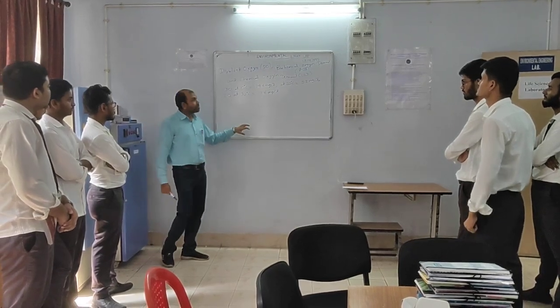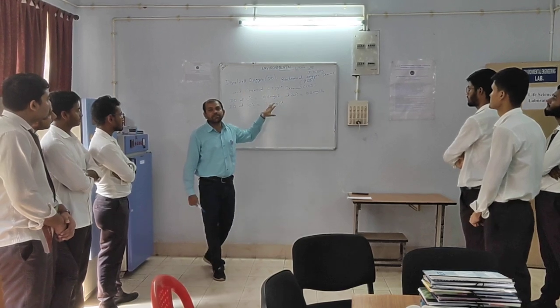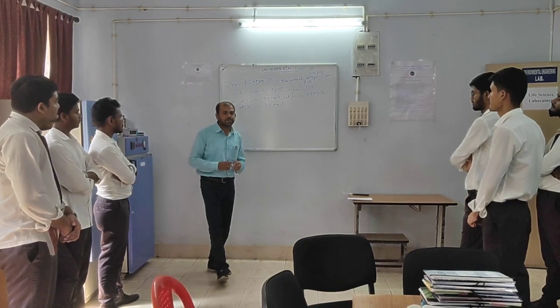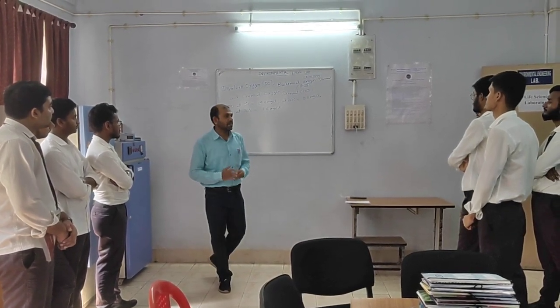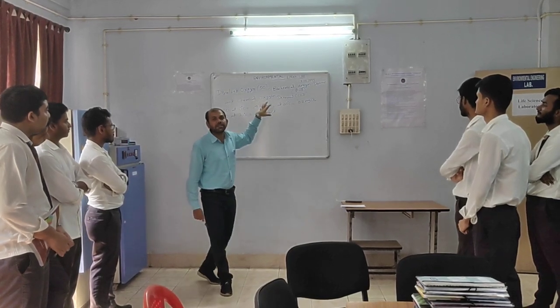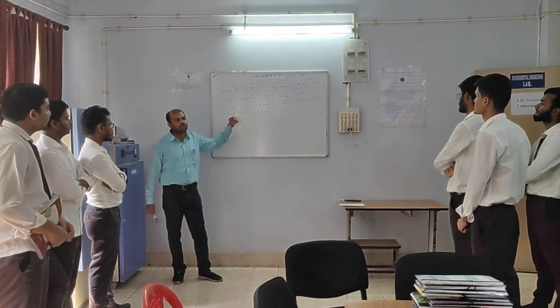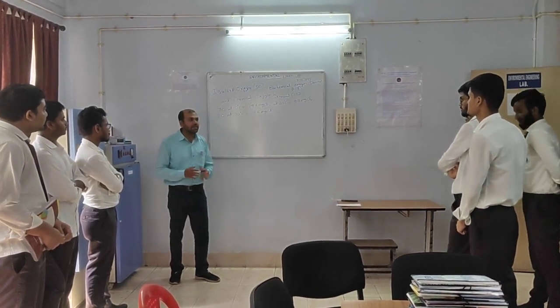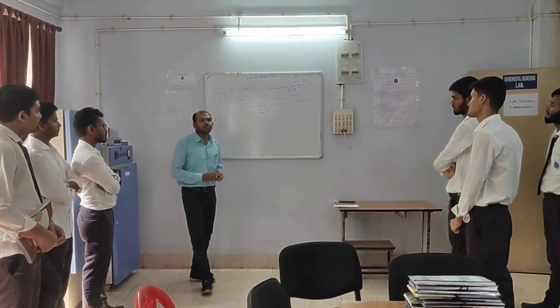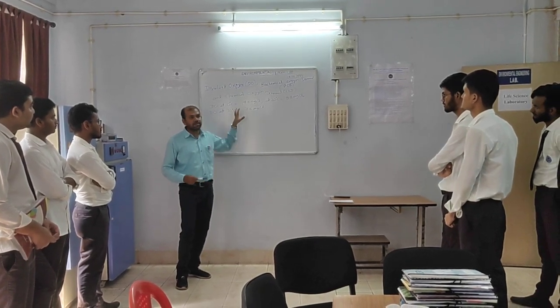Today we are going to perform dissolved oxygen, biochemical oxygen demand and chemical oxygen demand. These are three sets of experiments, but they are interlinked. For knowing the BOD, dissolved oxygen is a prerequisite. We must have an idea of dissolved oxygen, and only then can we conclude what the BOD is, right? And when we are doing BOD, COD is also an essential thing to determine. That is why we have taken all these things together.